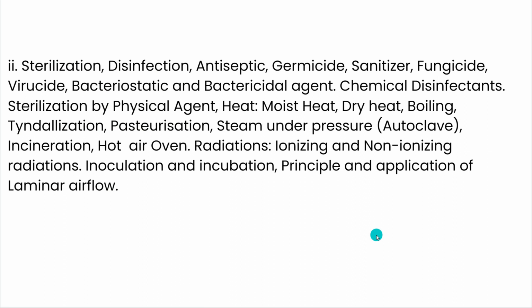So with this class we were able to study the different means of sterilization techniques. What do you mean by disinfectant, antiseptic, germicides, sanitizers, fungicide, virucides, what are bacteriostatic and bactericidal agents, chemical disinfectants and their types, sterilization by means of physical agents, heat, moist, dry heat, boiling, sterilization, pasteurization, autoclaving, radiation means of sterilization, and laminar airflow.